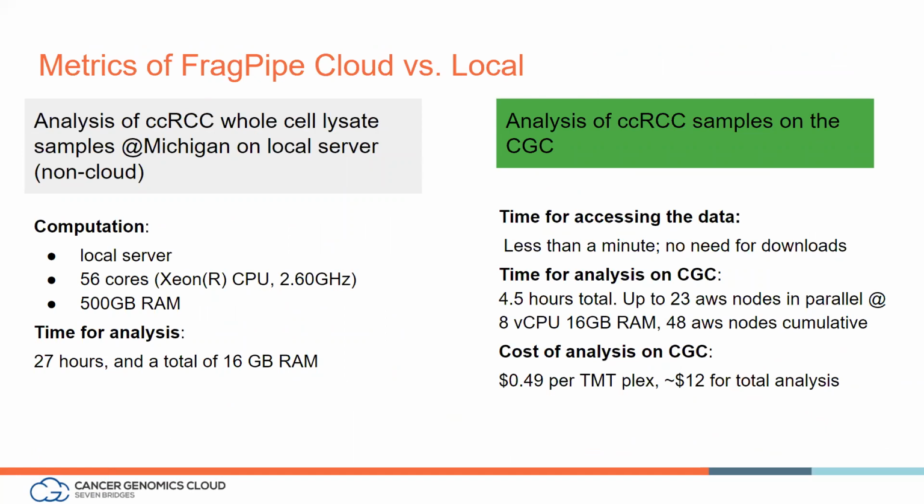For the CCRCC paper, more specifically, the kidney cohort is actually made of 25 different experiments. Each experiment consists of about 10 patients or samples, or in this case, about 10 different tags.